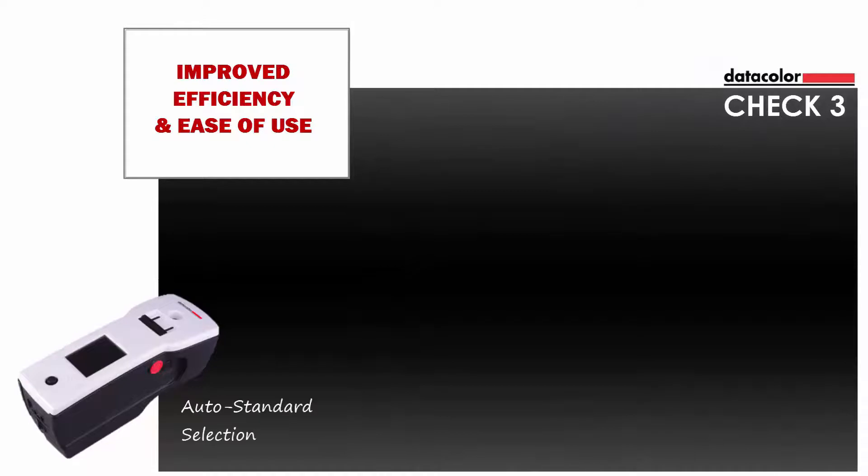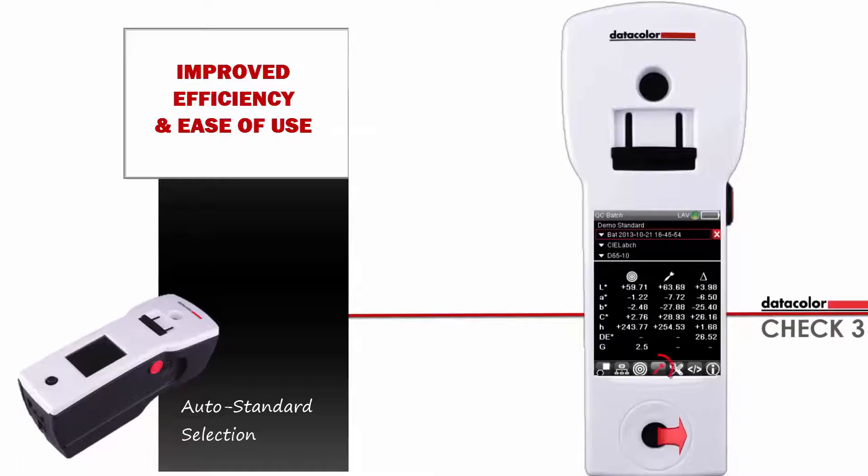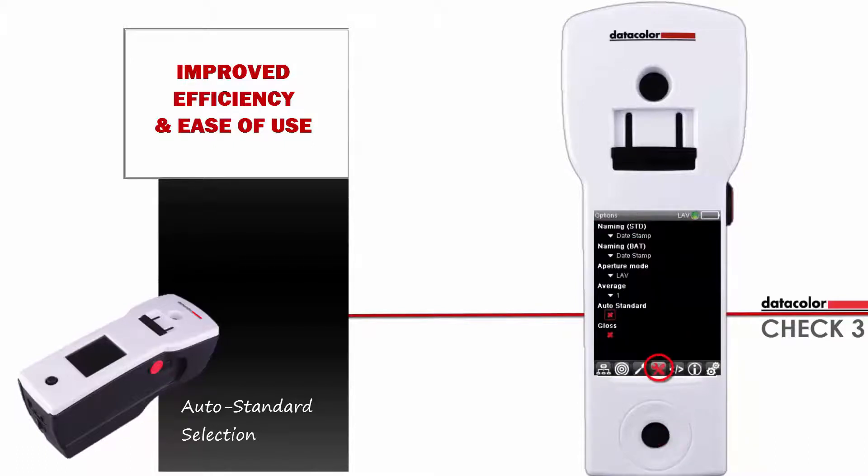The following clip illustrates the auto standard selection option. To enable auto standard selection, go to the options screen. Use the down arrow to go to the auto standard option and press the OK button to change the selection from a red X to a green check.